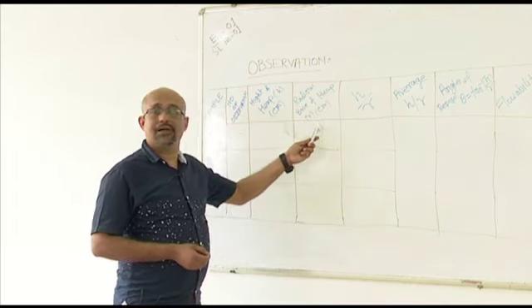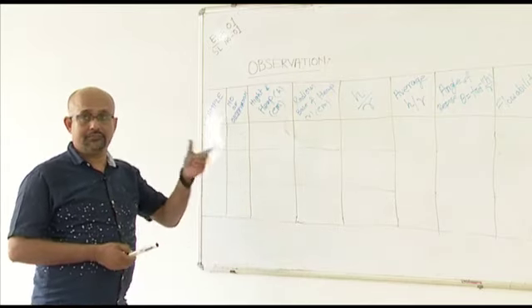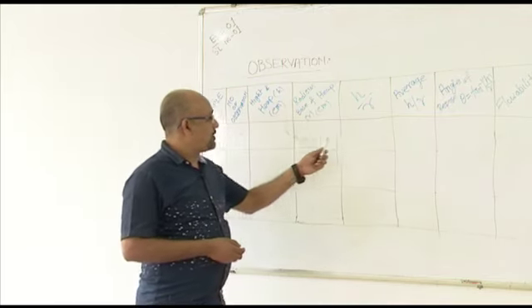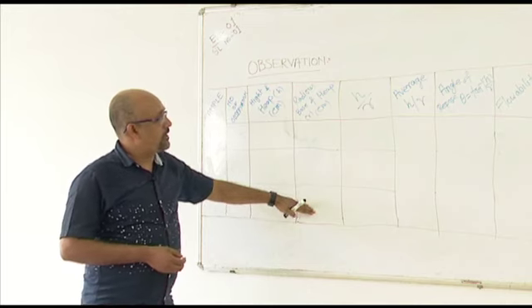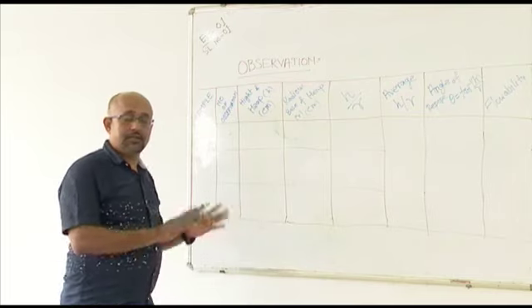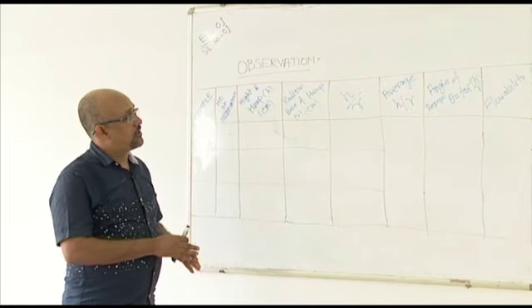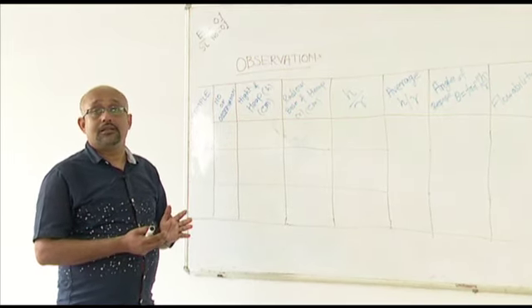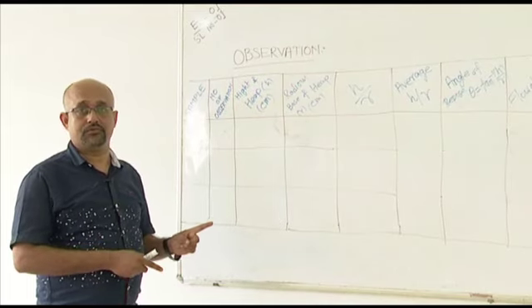We should divide it by 2, and the next column is the ratio h by r, meaning height by radius. If you have many experiments, then we will go for the average h/r. As in the beginning, when the introduction of the experiment was given, we know that for the angle of repose, tan theta is equal to h by r, where theta is the angle of repose.